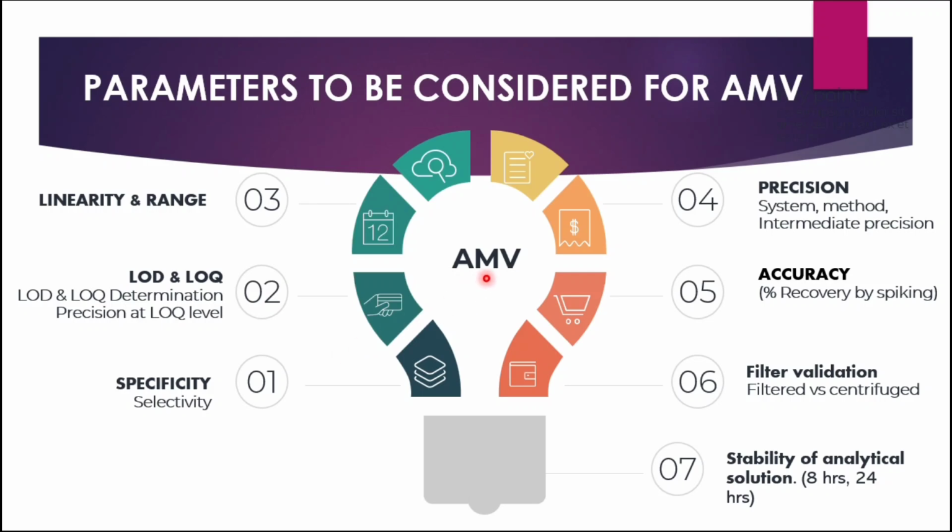So here we don't have that much of time to explain each and every parameter. Okay, so I am just considering which parameters to be considered. Then next parameter, that is precision, system precision, method precision, intermediate precision you need to consider, accuracy, that is percent recovery by spiking.